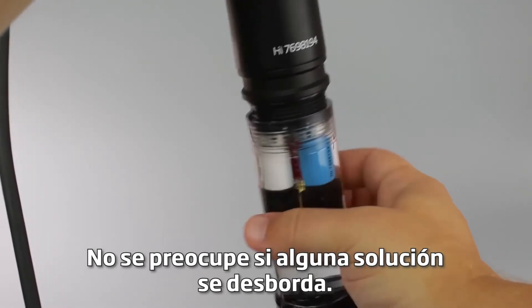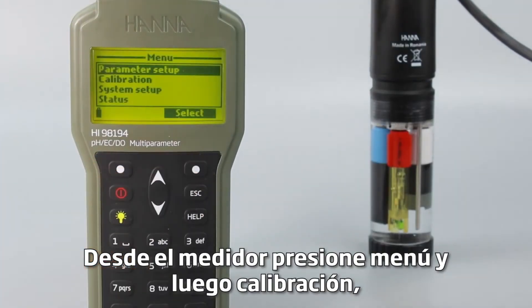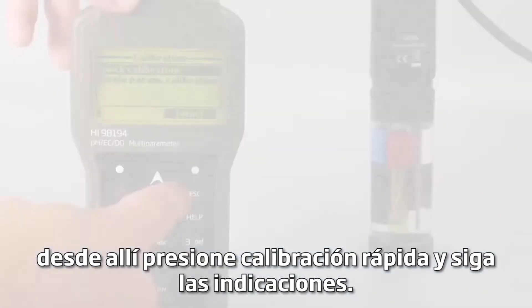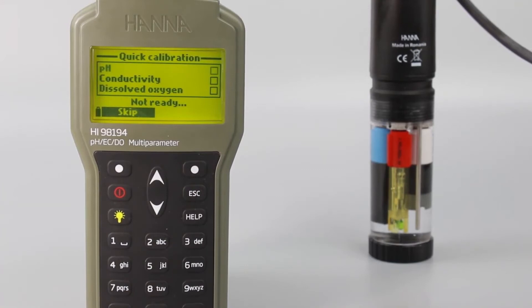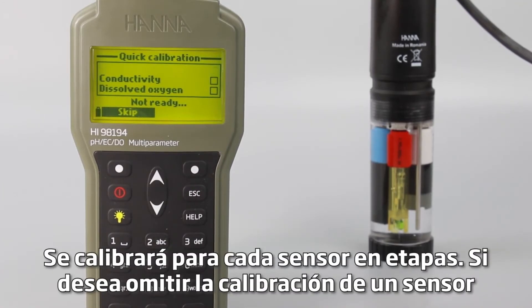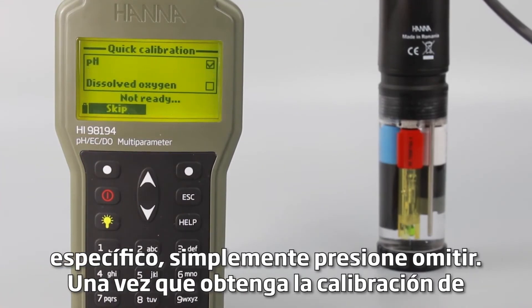Don't worry if some solution overflows. From the meter, press menu and then calibration. From there, press quick calibration and follow the prompts. You'll calibrate for each sensor in stages. If you want to skip calibration on a specific sensor, just press skip.